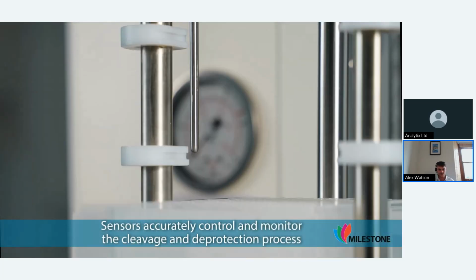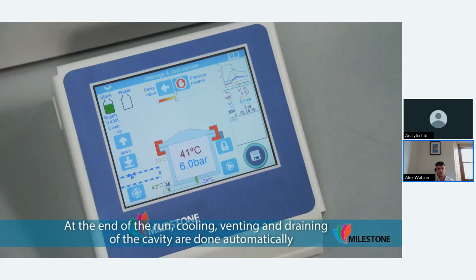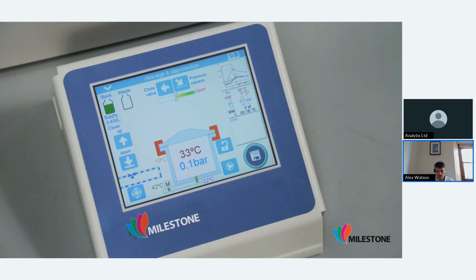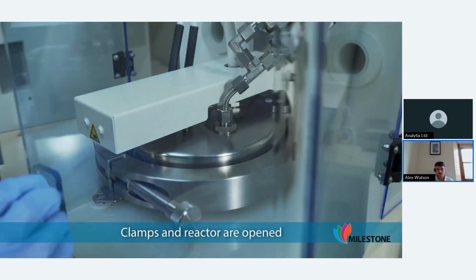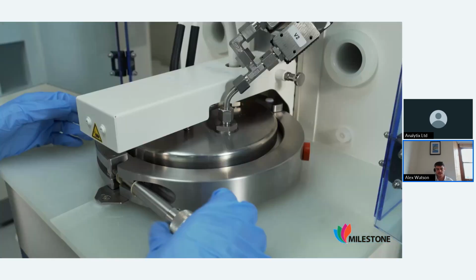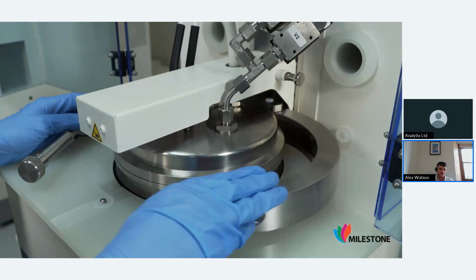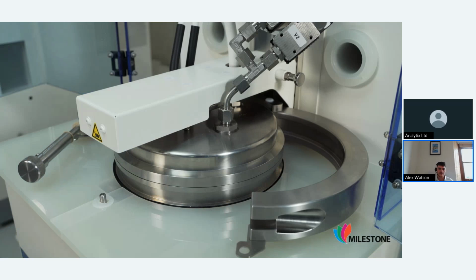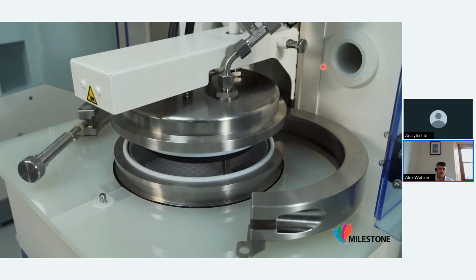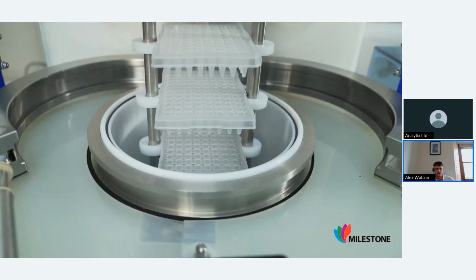We have a number of sensors that control and make sure that we have a really stable temperature and really sensitive temperature control. After the run, we've got really rapid cooling. We'll depressurize. We'll also perform purging runs to get rid of any of the C&D reagents, and we'll pump the C&D liquid reagent out of the reactor. After we've opened the clamps, then the system's ready to open. You'll notice we have these very powerful exhausts here. If there's any residual vapors, even after purging, they'll then be brought away from the user.